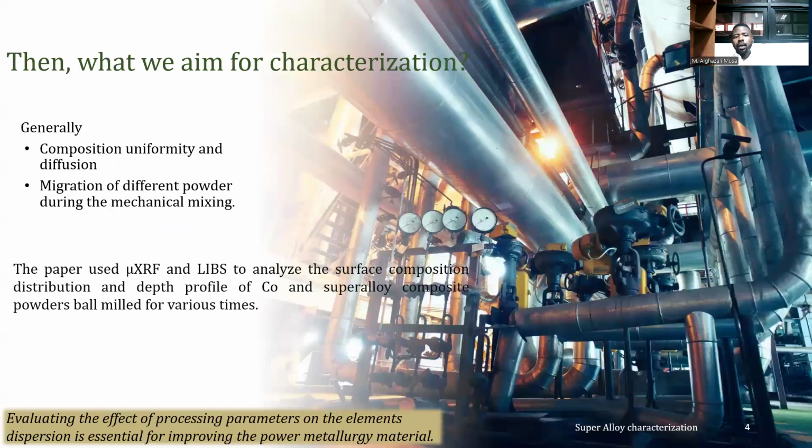Interestingly, we could do depth profiling through laser-induced breakdown spectroscopy in order to determine the composition uniformity and even the distribution, in terms of diffusion. And then we could also know about the migration of different powders during the mechanical mixing. So in general, we are using a synergetic way between micro-XRF and laser-induced breakdown spectroscopy for analyzing the surface composition distribution, and also the depth profiling to measure the effectiveness of the mechanical mixing among different grinding times.